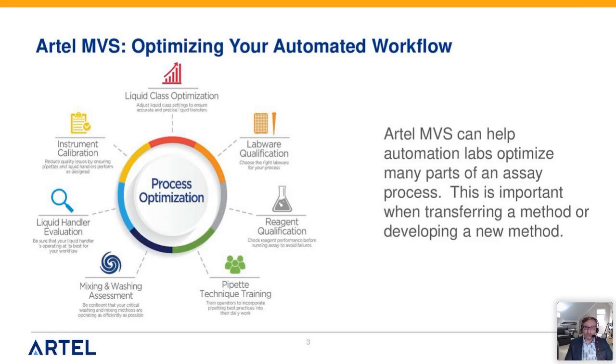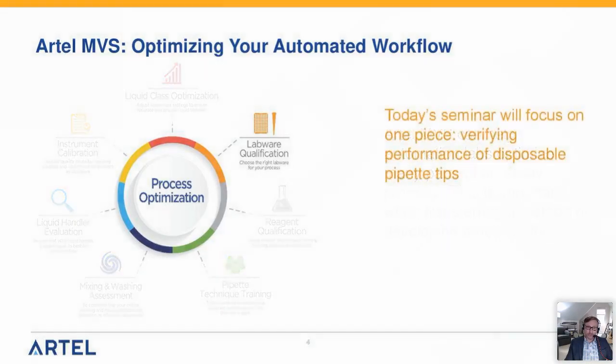a different laboratory. So for today, instead of talking about all of this, we're going to focus on the labware qualification portion of it, and very specifically I'd like to address the disposable pipette tips, and then again we'll talk about that in a little more detail.